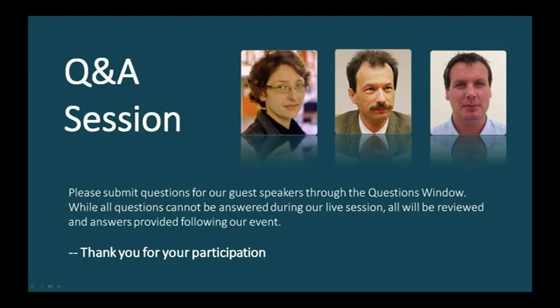Excellent. Actually, on that and how well certain mice are able to be trained and used in the system, we have a question about how well 129 mice learn in the IntelliCage. You have obviously experience with this, David. Can you provide some feedback for the audience? Yeah, this strain, or actually a whole panel of closely related strains, is well known for being very difficult in conventional assays, with performance very highly variable.